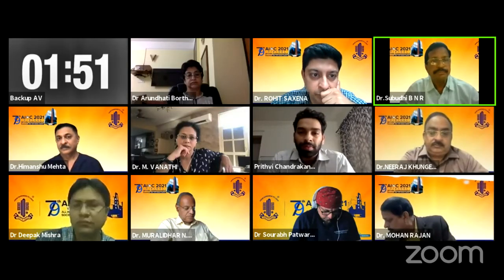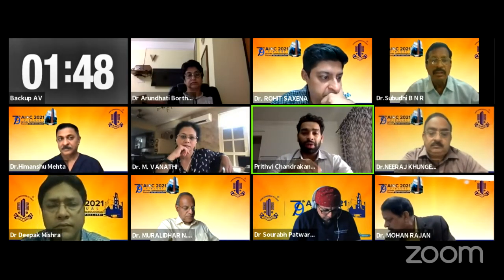Excellent innovative idea. Thanks a lot. It's very much cost effective, definitely. But my questions are: how much magnification do you achieve? Is it comparable to the ordinary lab microscope we have? Yes, sir. What I've used here is a 30 diopter lens, 4 of it. The magnification differs according to the lenses used. I have compared it with the normal microscope, and we are actually doing a study with fungal hyphae detection, and we have found it to be 100%. The magnification is 100x of the microscope which we use.